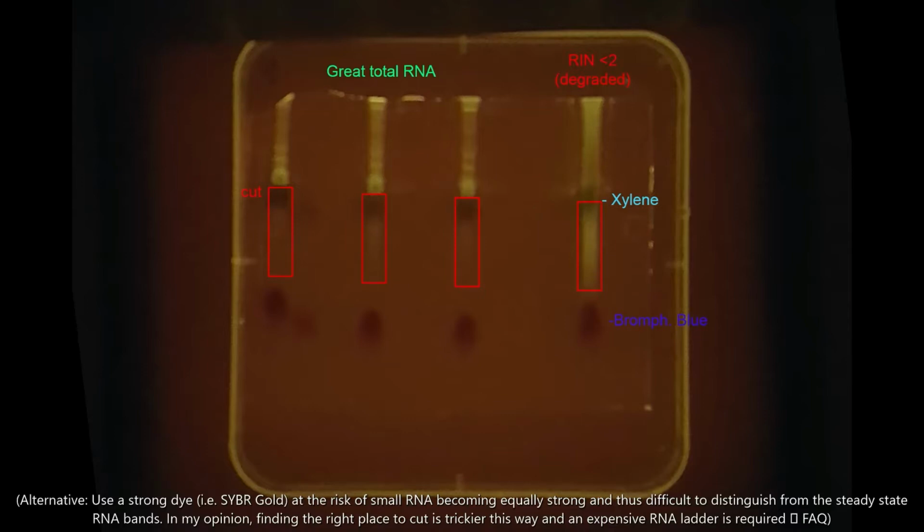As seen in this picture, this is a sort of negative selection area where the RNA is barely visible. It is important to note that you do not need to see anything to successfully perform the method. And indeed, as shown in the well furthest to the right, a prominent smear is more indicative of degraded RNA than of small RNAs. However, if you would load, let's say, 15 micrograms of nuclear RNA, you should clearly see the small RNA band and most strikingly the microRNAs.